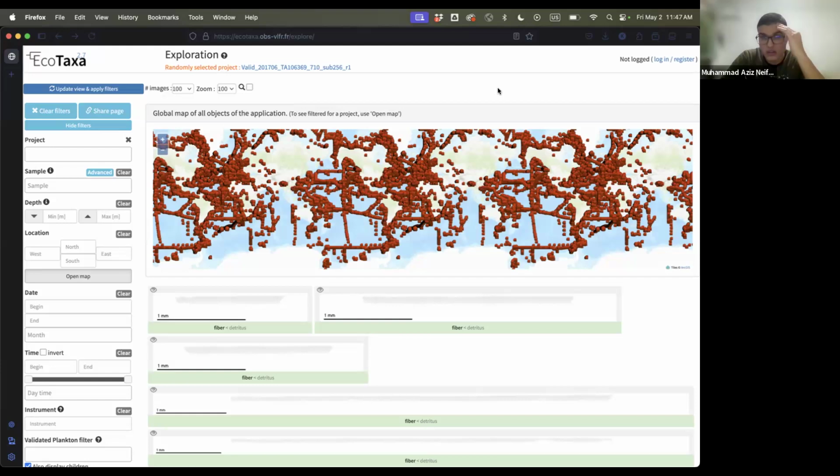You may implement a cloud service that contains a machine learning model, though I think it will not be that expensive. Or even if you don't have internet access, you could just provide your own computer that has the model and do the data analysis after transferring the data to that computer.